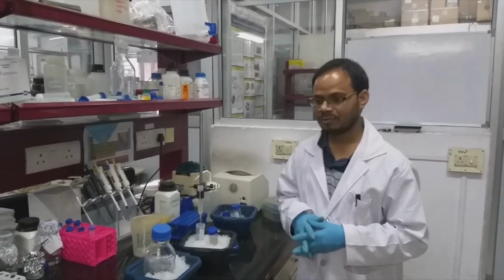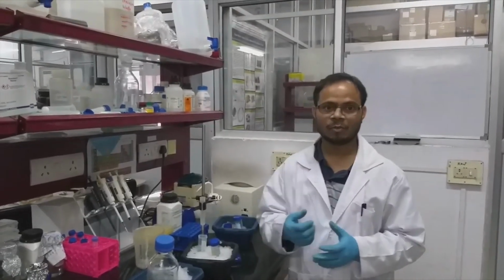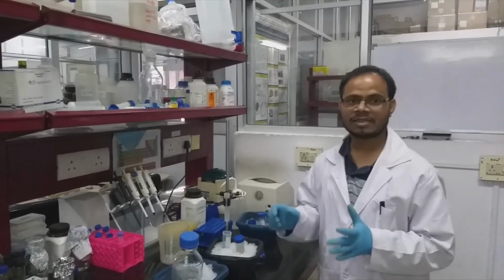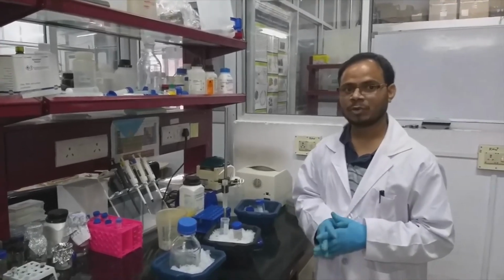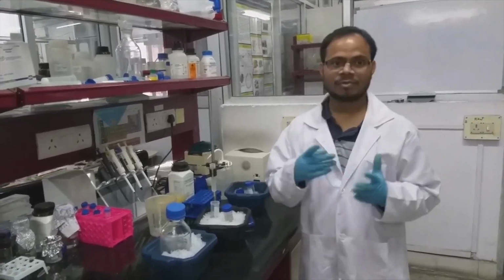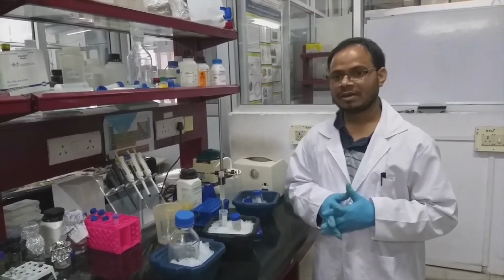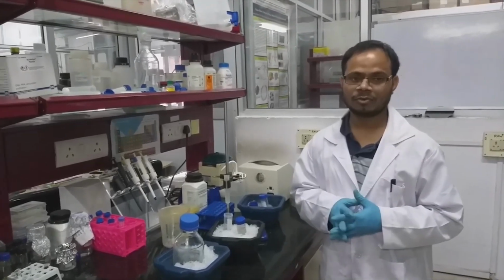While doing purification, we have to remember that every time you are introducing a new buffer, you have to collect the fraction, and this can be used for running SDS and testing the purity of the samples. Also, the flow through and the washing part that we have collected, we have to keep safely. After verification of the gel, only then we throw it away.